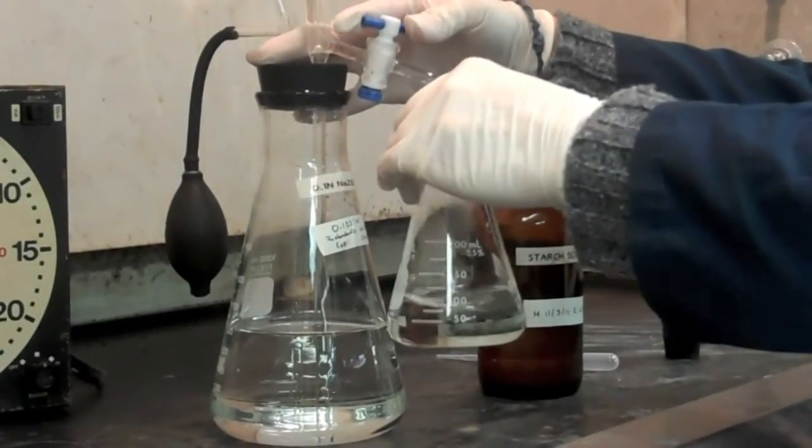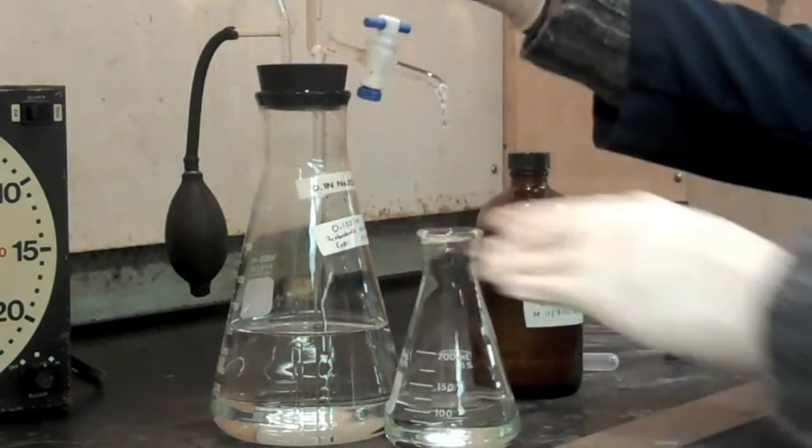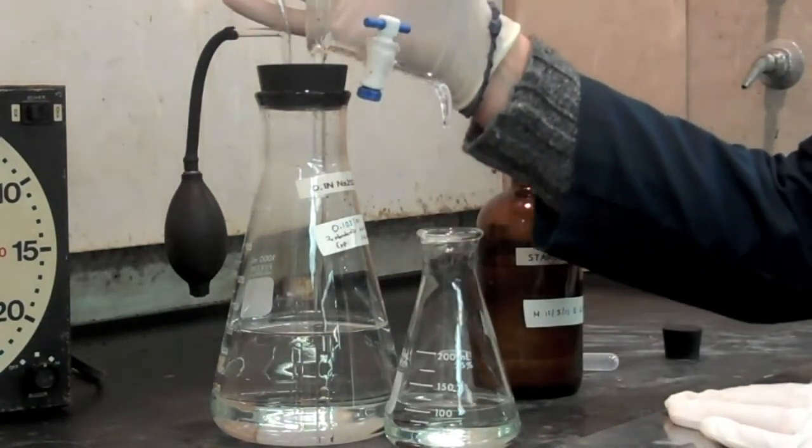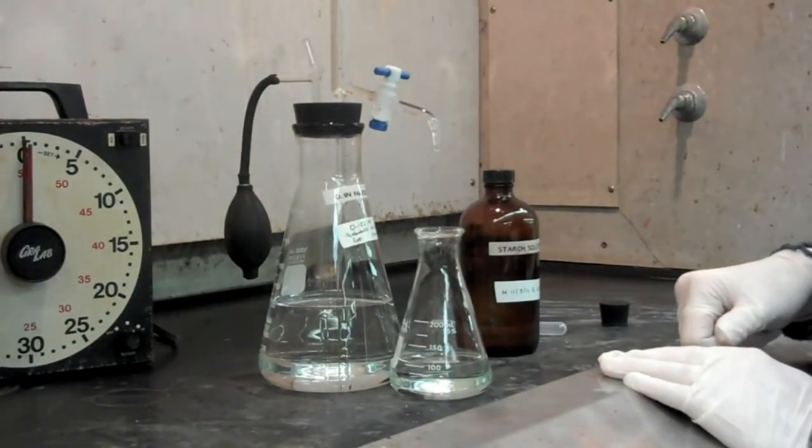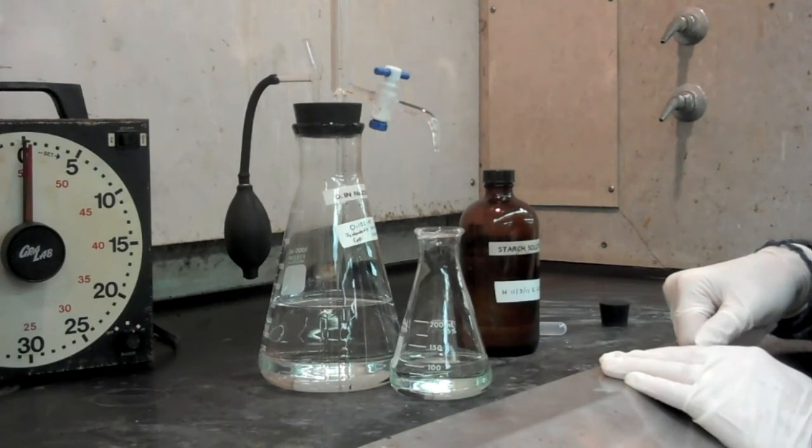And there you have it. So we're looking at the mils of sodium thiosulfate added. We've got 20.2. We will subtract that from the 50.0 mils of iodine, and that number gets plugged into a calculation that can be found along with the procedure on the technical data for all of our NITEC products. And there you have it.